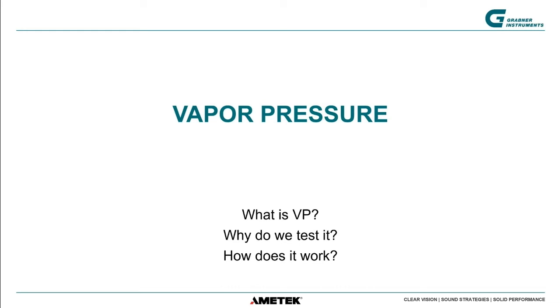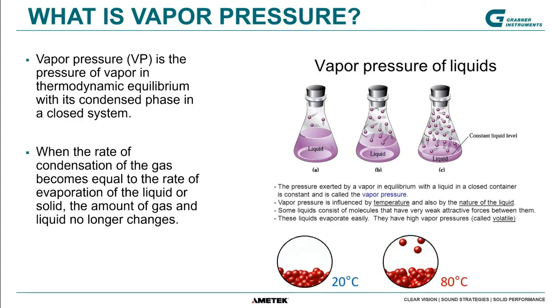So let's get into vapor pressure. First, I want to explain what vapor pressure actually is, why we test it, and then how it works and how it's implemented with our VP Vision Grabner instruments. What you see here in this picture is basically a representation of vapor pressure.